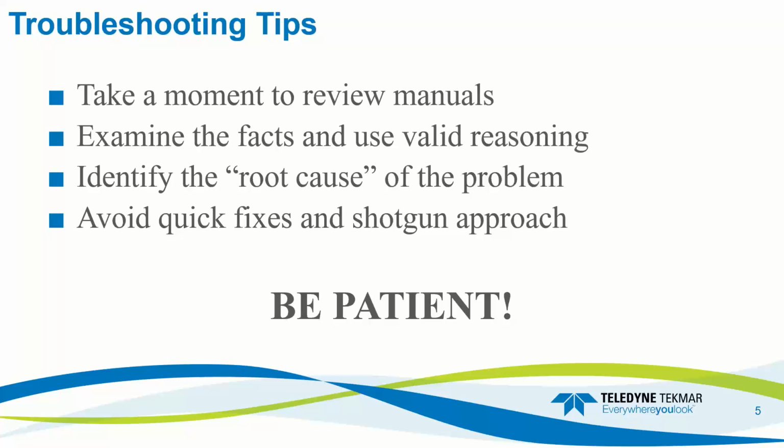You want to use those flow diagrams. You want to get a feel for what's going on. If you have missing peaks, little to no response, or issues with your internal standards, that might help you identify the root cause of the problem, whether it's coming from the GCMS, or the Purge and Trap, or the autosampler.